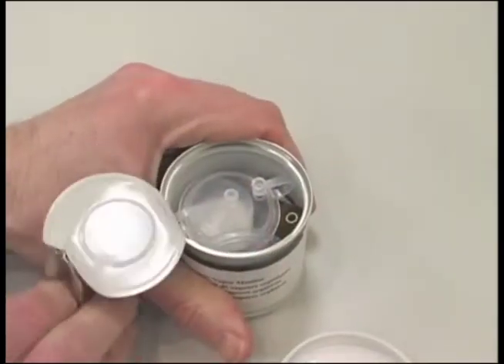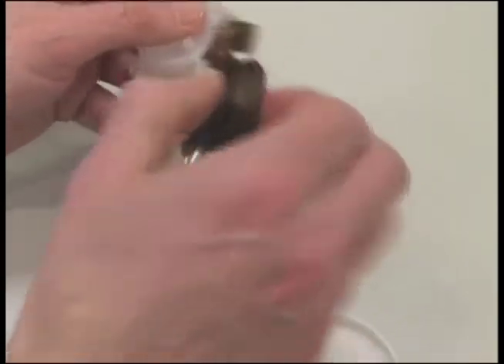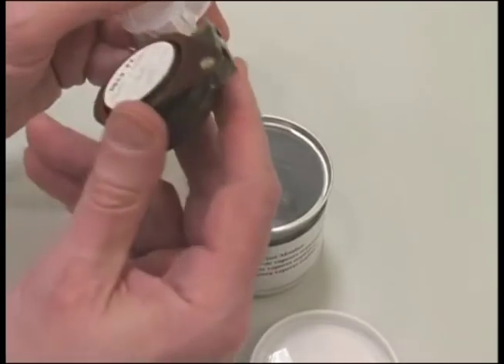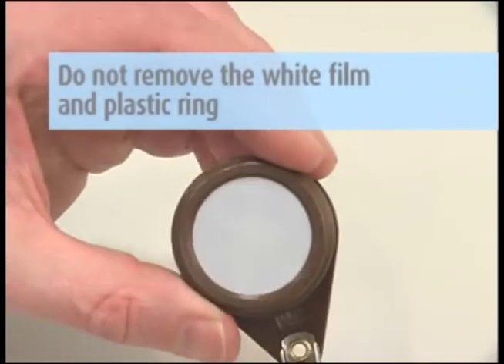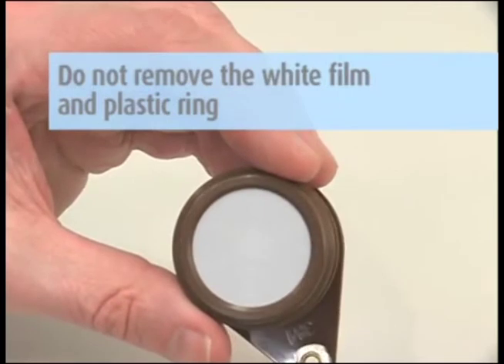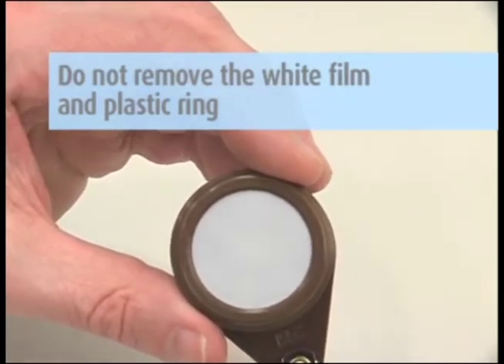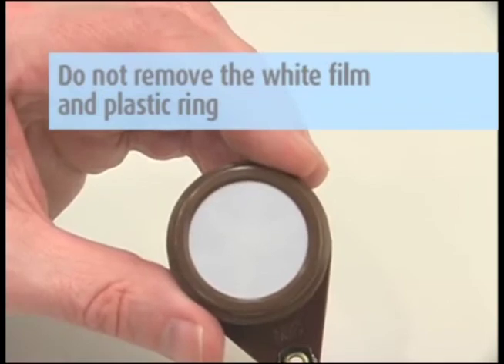Remove the diffusion monitor from the can. Record the date, employee or area ID, and sampling start time on the monitor label supplied and the relevant information on the base of the OVM itself. Do not remove the white film and plastic ring. The white film is a dust cover to prevent dust buildup inside the monitor.